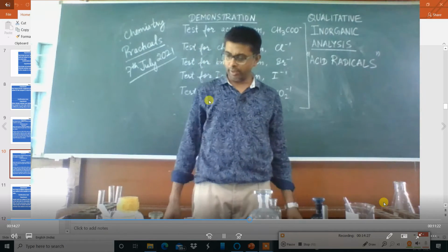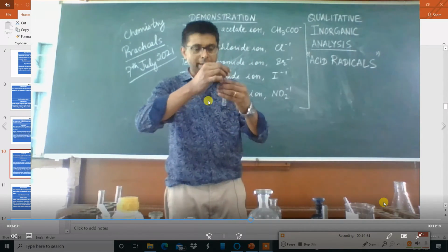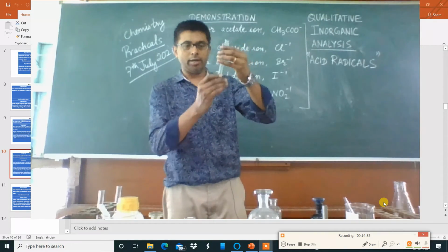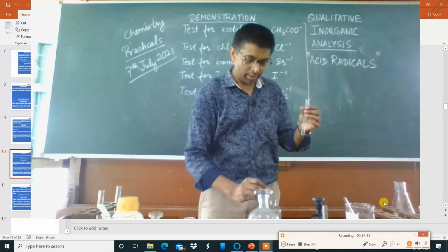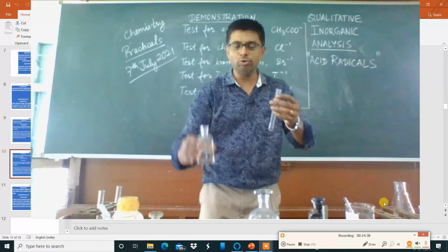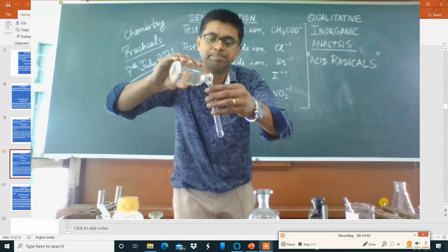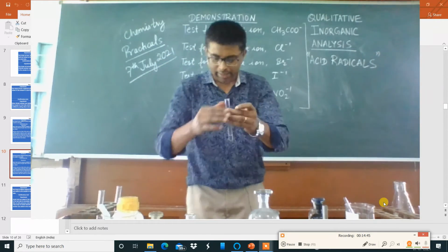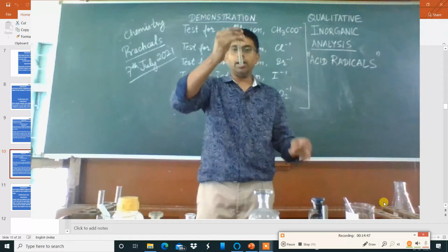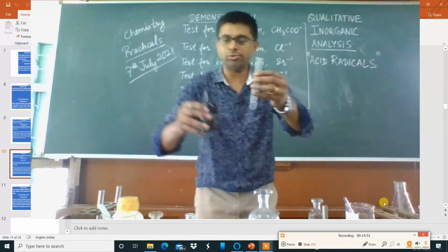Then the second part after this, I had shown you the confirmatory test. Dilute nitric acid was added first to the soda extract to acidify it, and then silver nitrate solution was added after acidification.